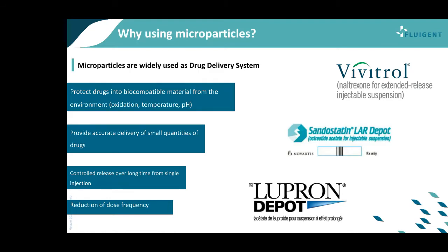Then it allows us to provide accurate delivery of small quantities of drugs by controlling the particle size and the concentration of the material used. We can control the delivery of the drug in small quantities, and control the release over a long period of time from one single injection, which can lead to a reduction of dose frequency.